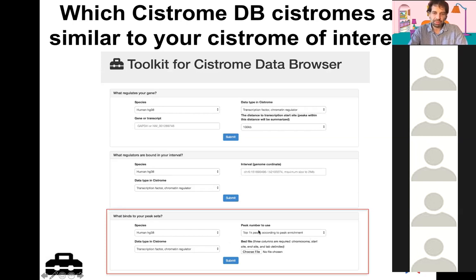You can compare this either to the top 1,000 peaks in the Cistrome for each sample, or the top 10,000 peaks for each sample if they exist. Then you submit, and it will give you feedback of what's similar to your set of genomic intervals.